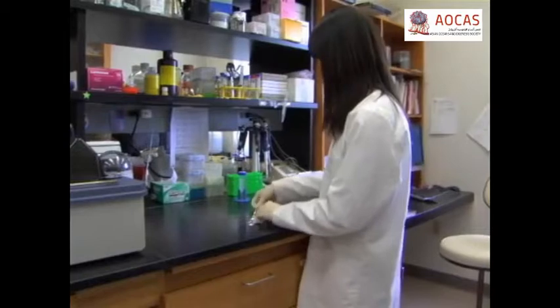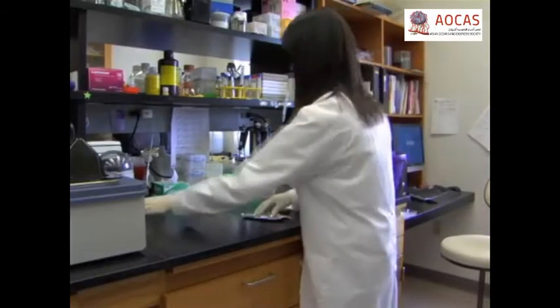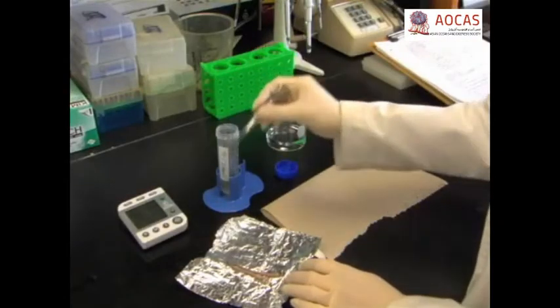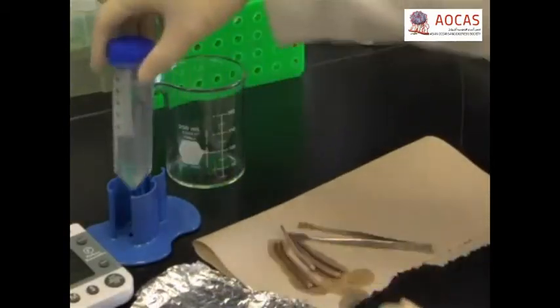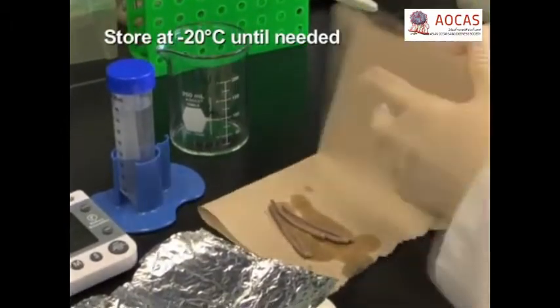After sacrificing five to seven mature normal female C57 black six mice using approved IACUC methods, harvest the tails and soak them in 70% ethanol for 45 minutes to sterilize them. Dry the tails with tissue paper, wrap them in aluminum foil, and store them at minus 20 degrees Celsius until needed.